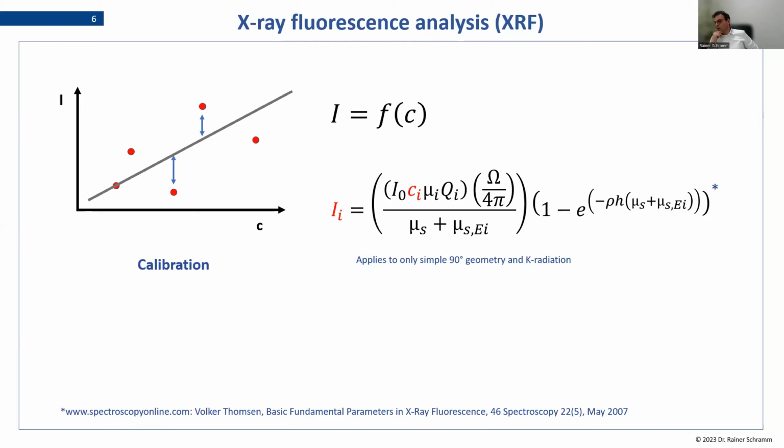In the real world, it's not possible, but just by calculating from the elements to the oxides, you can get a sum of more than 100%. The same happens when you have calcium fluoride in a sample and you express your result as calcium oxide. The oxide is not there, but you express it as calcium oxide, so your sum will go over 100. But this is only a theoretical thing. It has nothing to do with the real world.